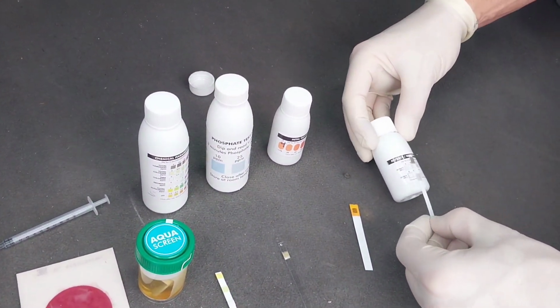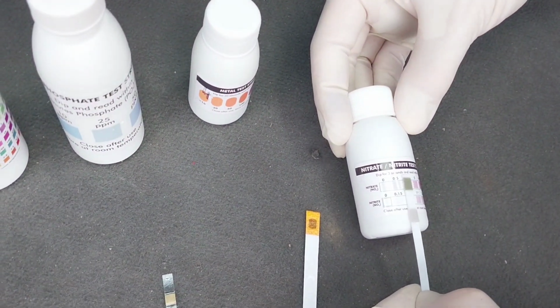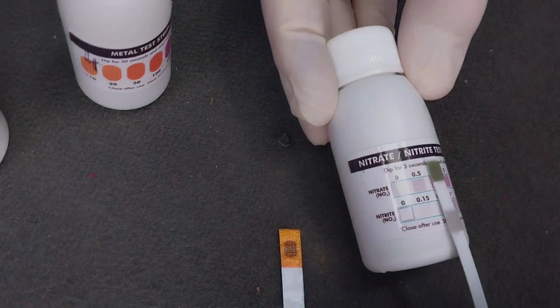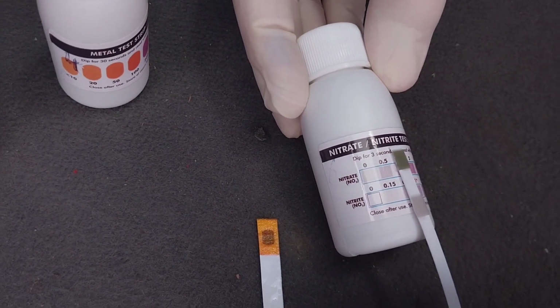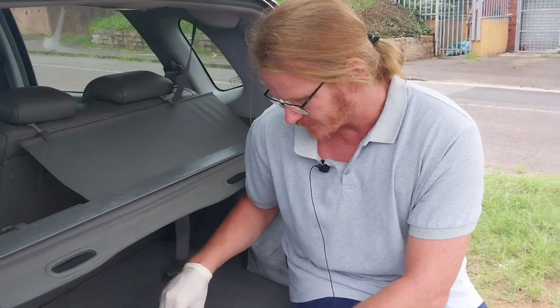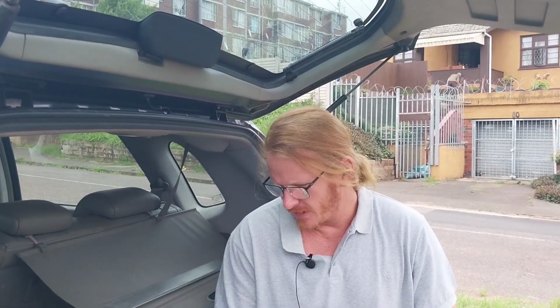And then lastly, these colors seem to be slightly going off here, but I think we can probably put them around here, 0.5 and 0.8, in fairly safe levels. So what we're actually seeing here is that the fertilizer type of content, nitrite, nitrate, phosphate, is quite low, but we do have a high metal content, which is not great and probably needs a deeper inspection. We've also got very low chlorine.